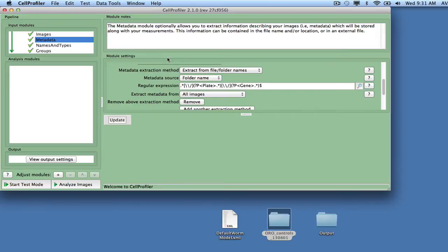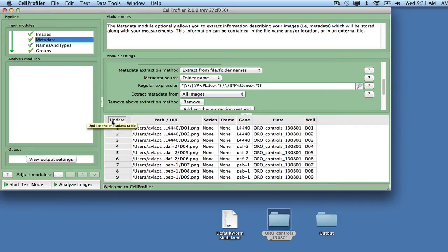Verify your metadata extraction using the Update button below the module settings to ensure that each input image from the images module is associated with the plate, gene, and well ID metadata.